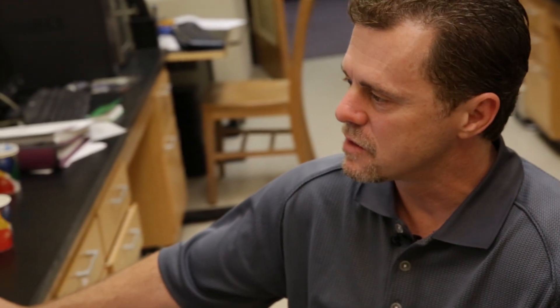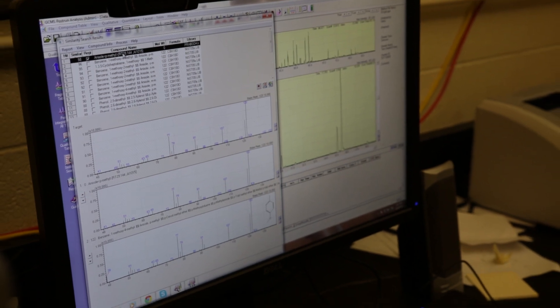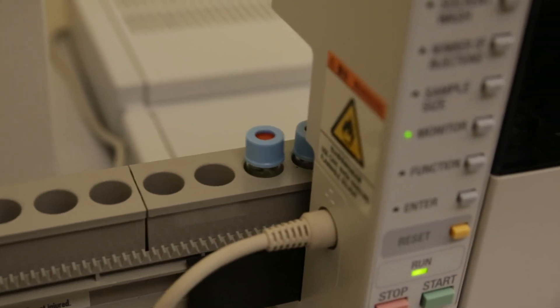What you'll see here is a line that's going to slowly draw out. This is a graph of intensity of the peak versus time, with time on the x-axis. As you can see, this run is going to go out to 105 minutes.